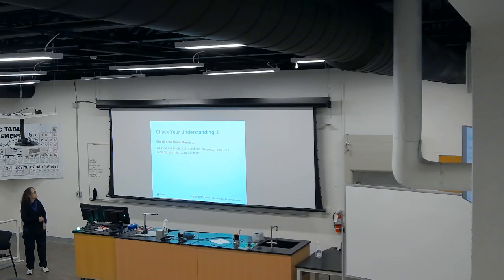Okay, so question: how are bright field, dark field, phase contrast, and fluorescent microscopy similar?